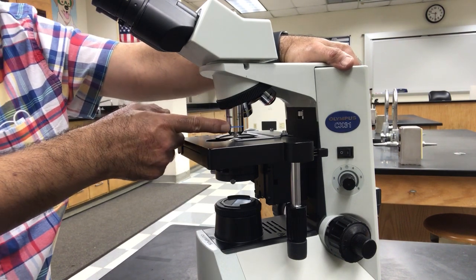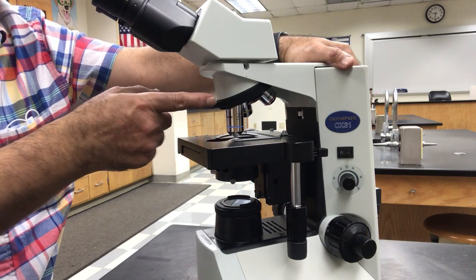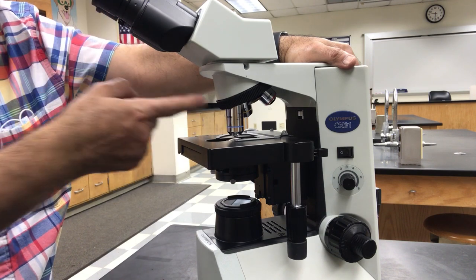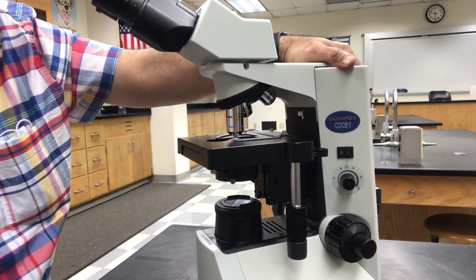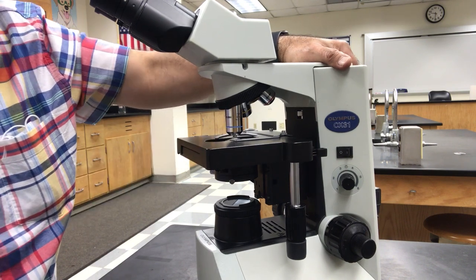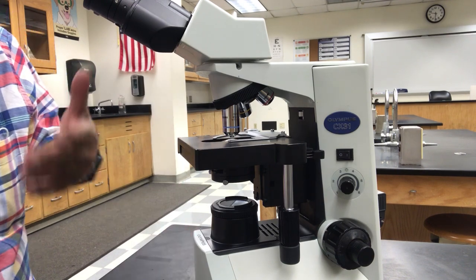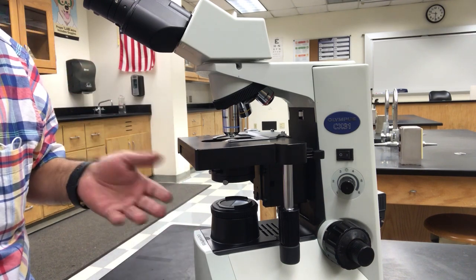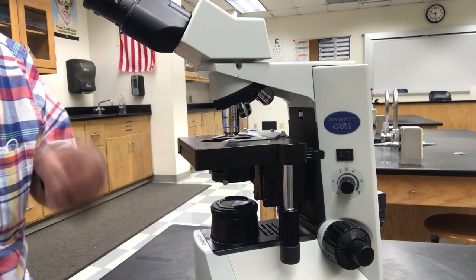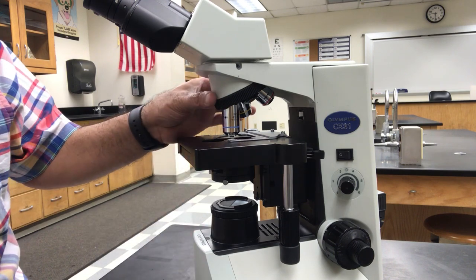So when you have the high power lens in place, its own magnification is 40 times, but the total magnification would be 400 times. In other words, with this instrument, we can make an object 400 times larger, and that is enough to let us look at a cell membrane, nucleus, even chromosomes inside the nucleus.